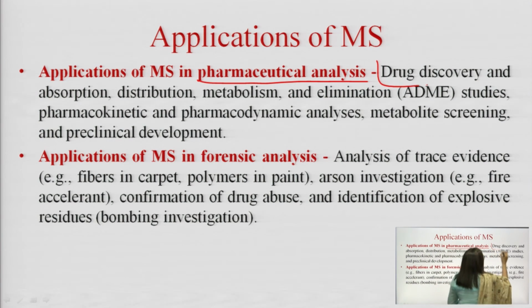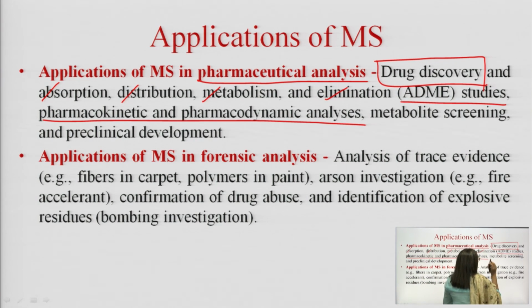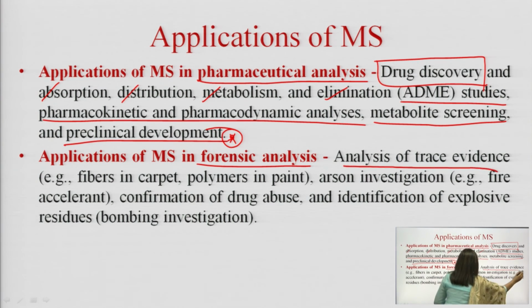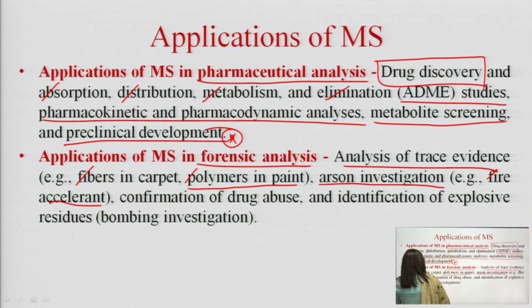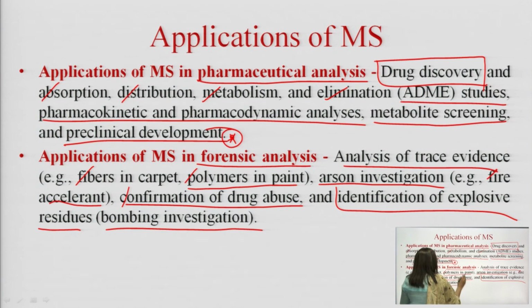Starting from drug discovery or new drug development and ADME studies that include absorption, distribution, metabolism and elimination studies, pharmacokinetic and pharmacodynamic analysis, metabolite screening and preclinical development, MS plays an important role.